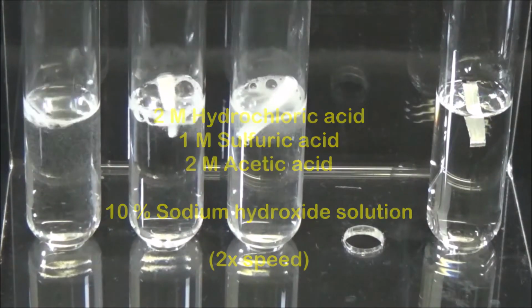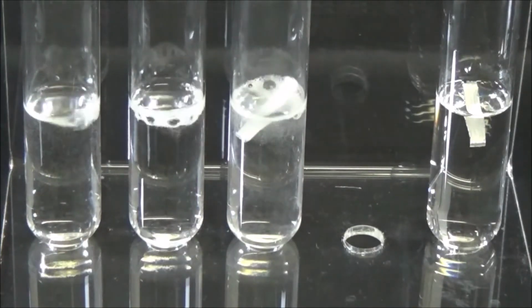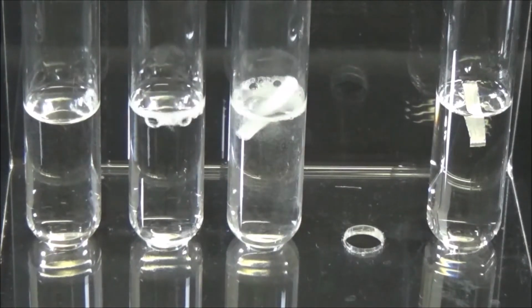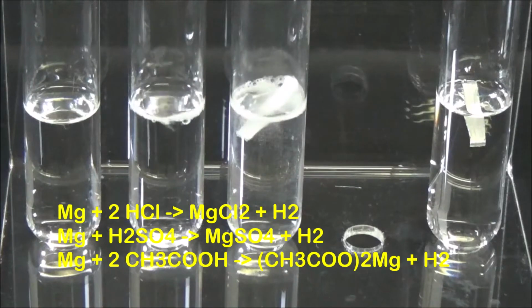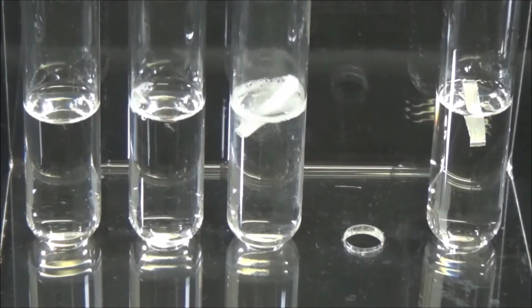The concentration of the acids was chosen so that each solution has the same number of protonatable hydrogen atoms and is therefore comparable in terms of acid strength. The acids react with the metal to form their respective magnesium salts, chloride, sulfate and acetate, with vigorous liberation of hydrogen gas. As the strongest acid, hydrochloric acid dissolves the piece of metal the fastest, followed shortly afterwards by sulfuric acid. Acetic acid takes significantly longer.